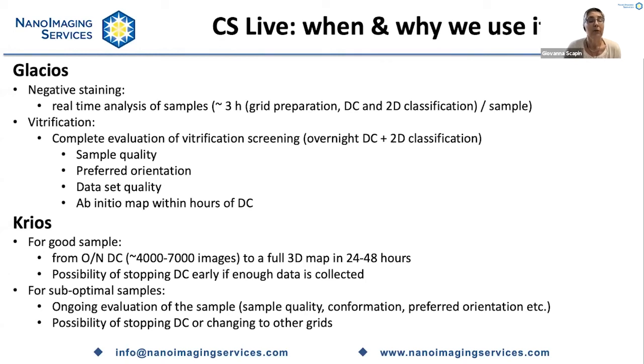We do a lot of preliminary work for vitrification. We see a lot of very difficult samples that are seeing cryoEM for the first time, and so there is a lot of screening that we need to do for optimal conditions. Using cryoSPARC Live, we can run in parallel with an overnight data collection, and by the end of the data collection understand the sample quality and whether there is an issue of preferred orientation. We can again provide the client with a much better characterization of the grid preparation, the quality of the grids, or the vitrification system that we utilized to make those specific grids.